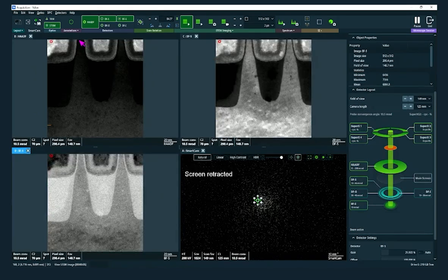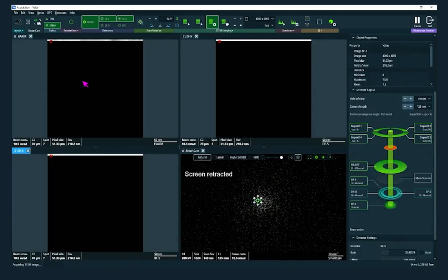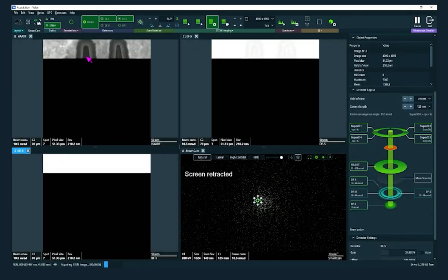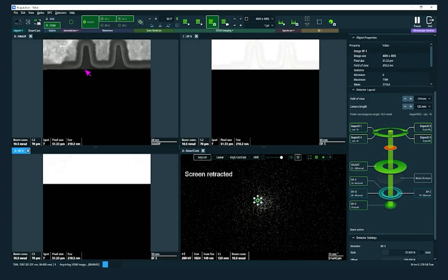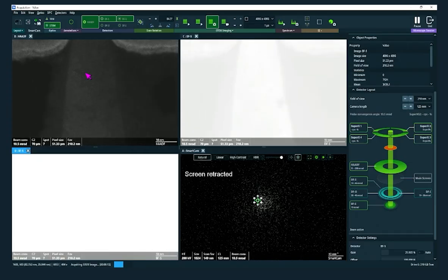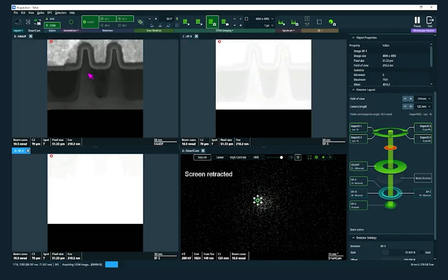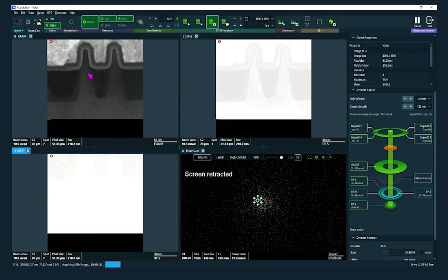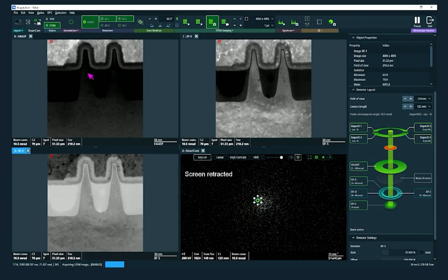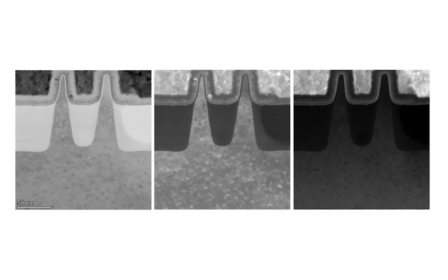From this point, our exacting image distortion and magnification calibration specifications can enable reliable final measurement of device features and atomic-scale defects. These measurements are critical for accurate analysis. Here are the high-contrast, atomic resolution images.